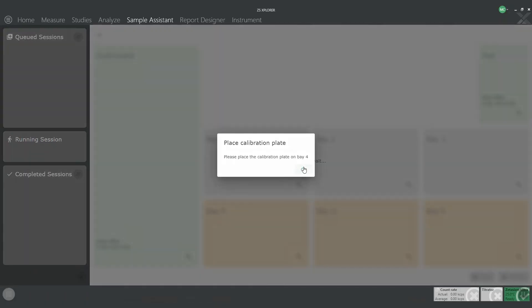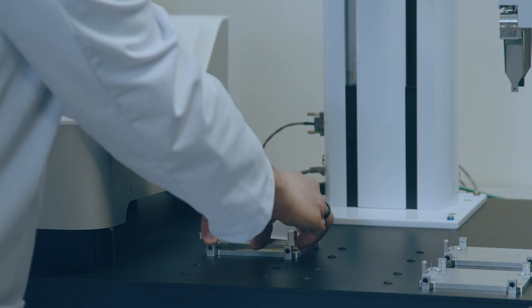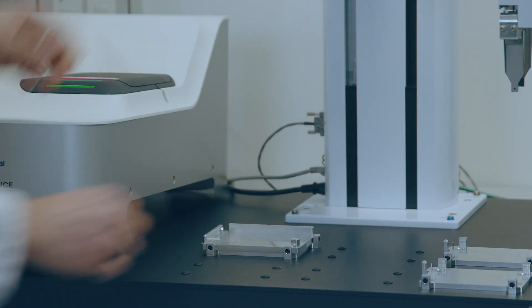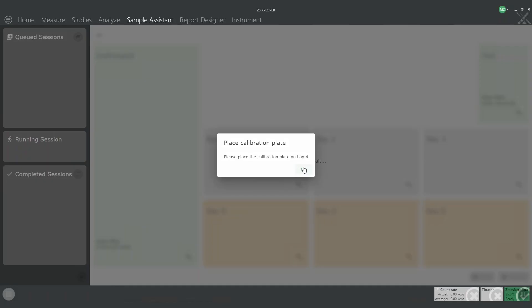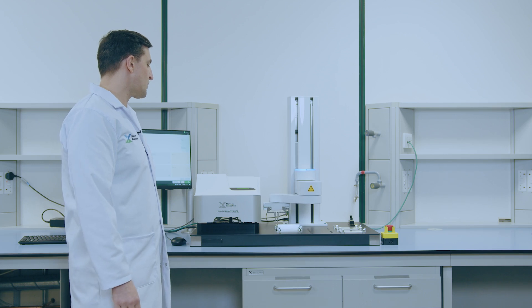Once this location has been found, the software will ask you to place the tray calibration tool on the position. Once it's in position, just press OK and the arm will finish the configuration process.